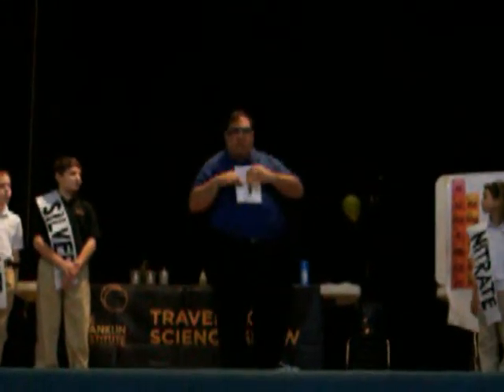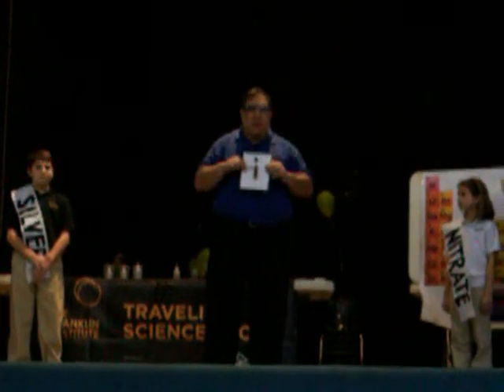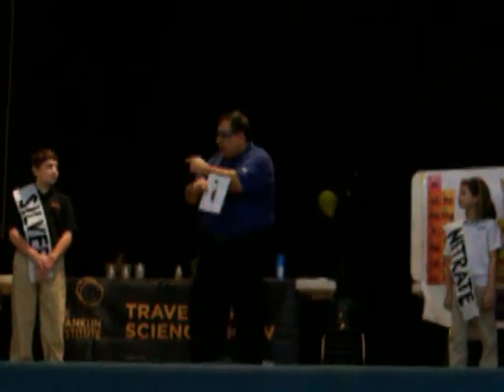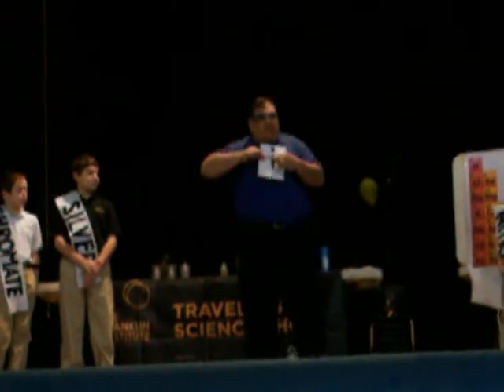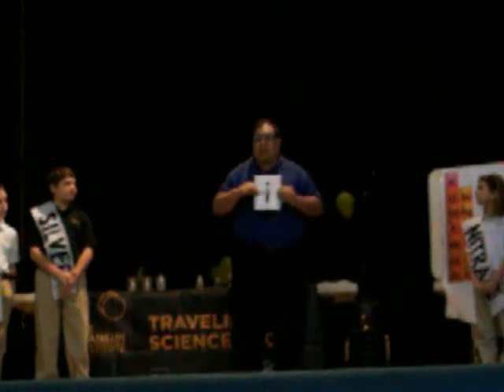The red that you see here are actually small little pieces, solid particles of something entirely new, a chemical called silver chromate. And the silver chromate is falling, sinking right now to the very, very bottom of this test tube. It's called precipitation. This is a precipitation reaction.